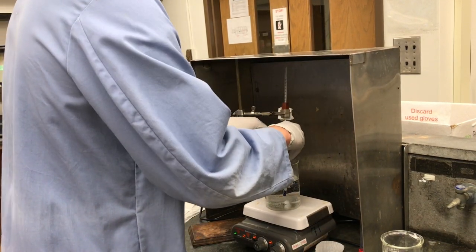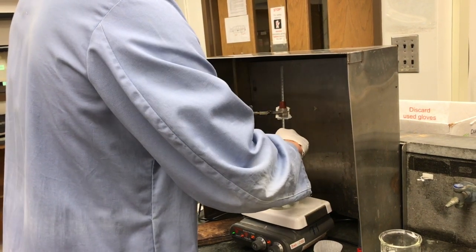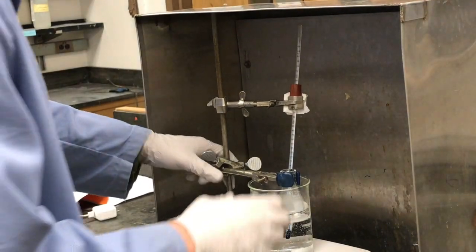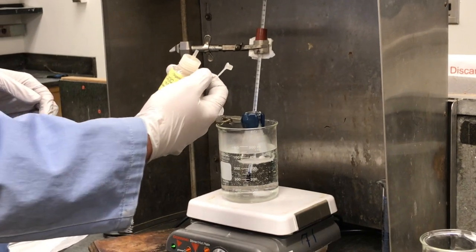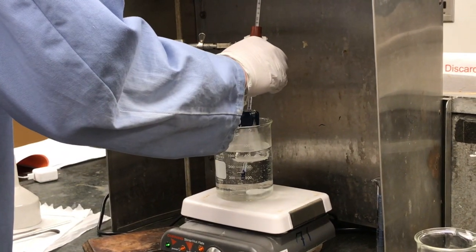And then we'll set that in the bath to heat. The bath is currently reading about 50 degrees. And we need to make sure we add our 2 drops of concentrated sulfuric acid to catalyze this reaction.